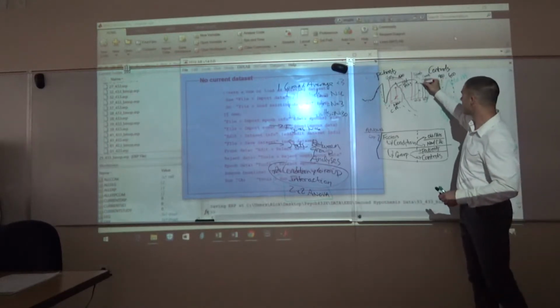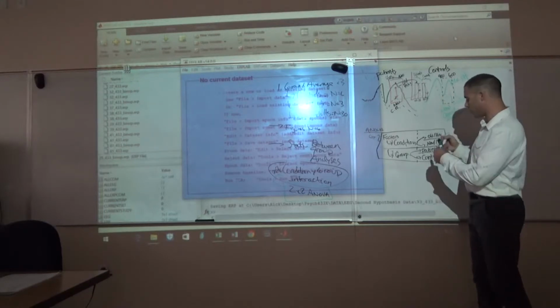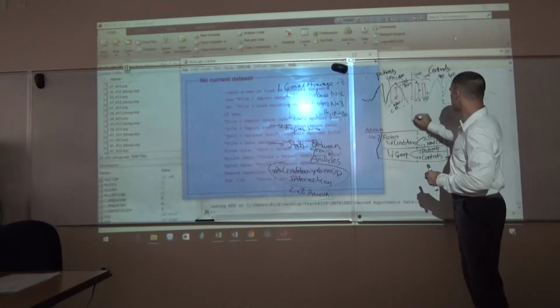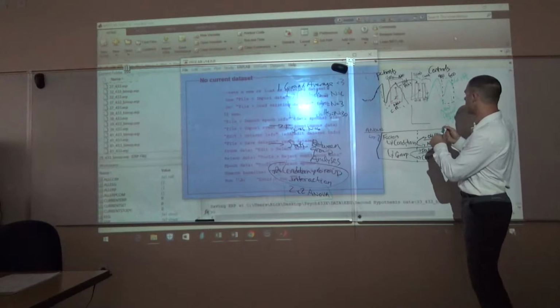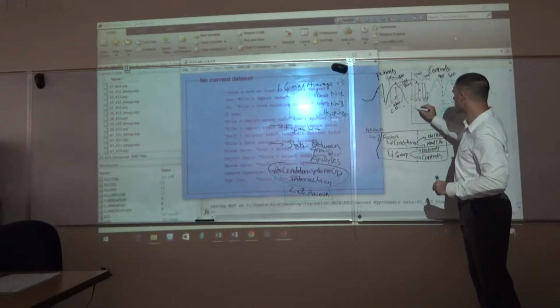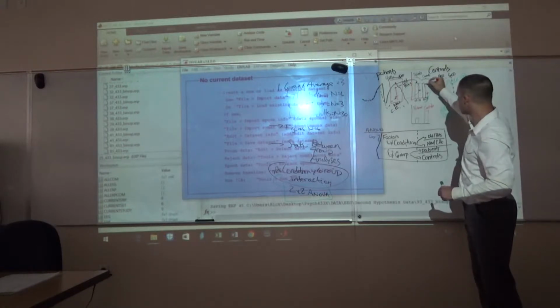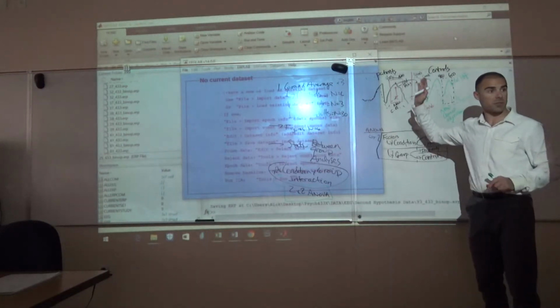So let's say this difference, okay, if we plot a graph of this difference for, let's say, patients. Let's say that difference is about there. And let's say your controls, see how this big difference here is bigger? And this here is smaller? That's a subtraction, right? That our t-test assesses for each individual group.